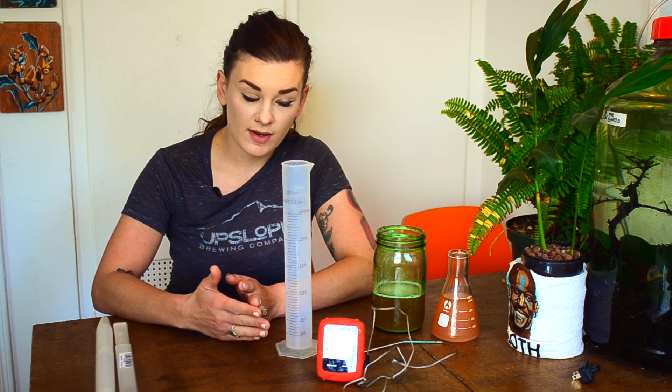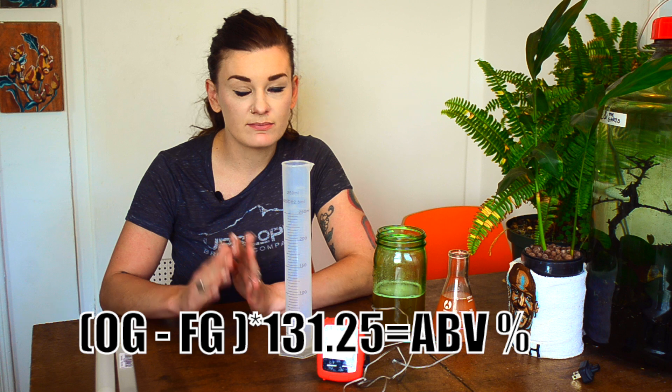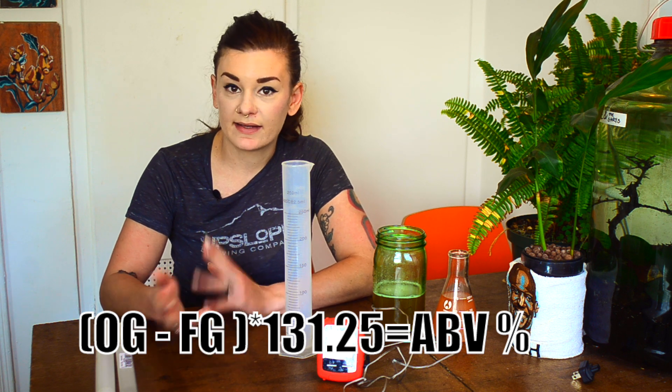Today I'm going to talk about reading gravity using two different methods: the hydrometer and the refractometer. The hydrometer is the simplest way to measure gravity, which relates to your alcohol by volume or ABV percentage. You take a reading before your wort is fermented and a reading after, then subtract the second from the first, multiply by a number, and that gives you your ABV.